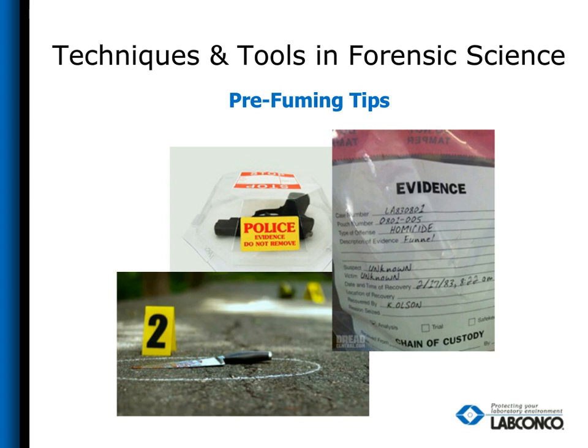A few of the bifurcated decisions that have to be made is if DNA or trace evidence is going to be collected prior to this type of processing. Also, another issue that causes the loss of information is drugs being packaged with the evidence that's going to be processed for latent prints later on. Separation of these types of evidence from the packaging early on in the process helps increase your success rate later on.